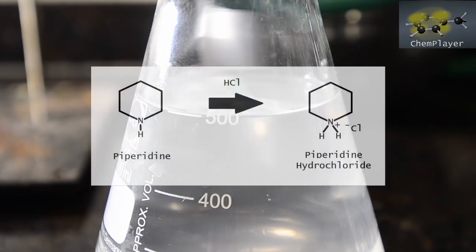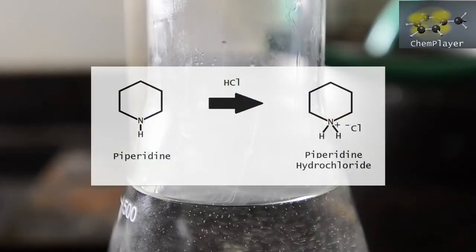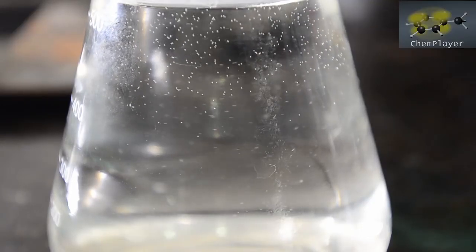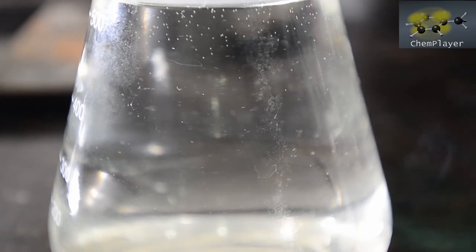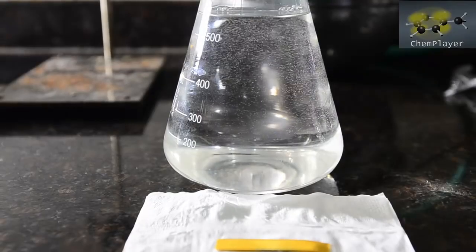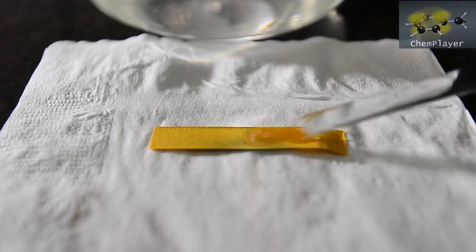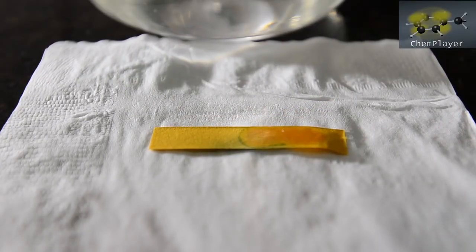The effervescence does suggest that there's some sodium hydroxide that's made it over and converted into sodium carbonate via the CO2 in the air. We've added acid carefully, checking the pH, so let's try one last time. Slightly acidic, which is perfect. Don't add too much acid or you'll have trouble removing it later.